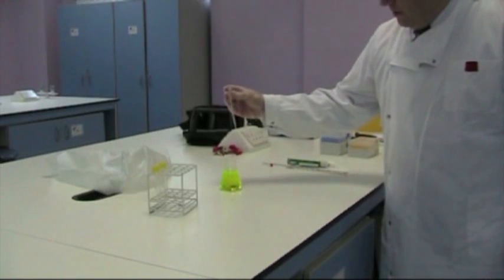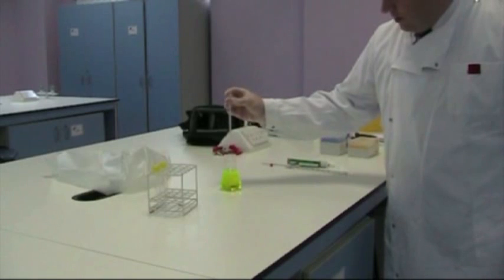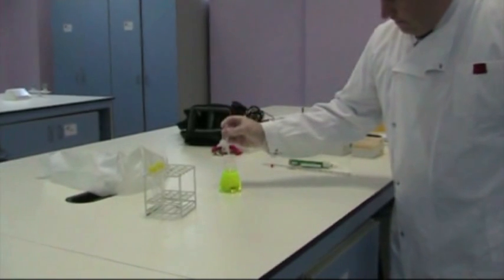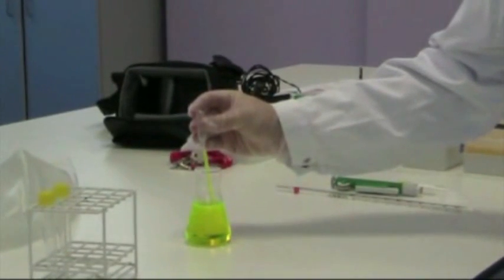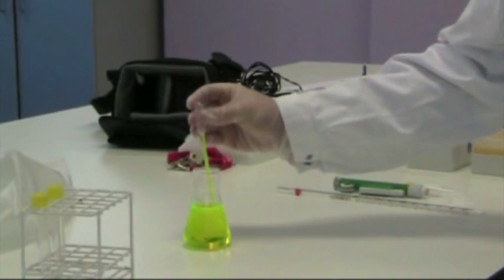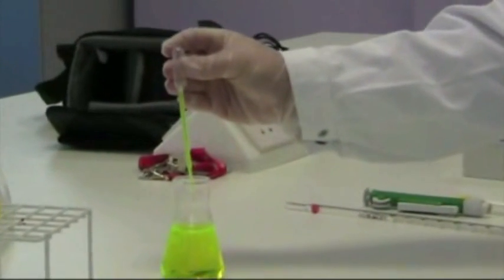So in order to draw the liquid up squeeze the air from the bulb at the top with your finger and your thumb. Put it into the liquid and gently draw it up until it reaches this one mil point here. Remember this isn't very accurate this is just for speed.